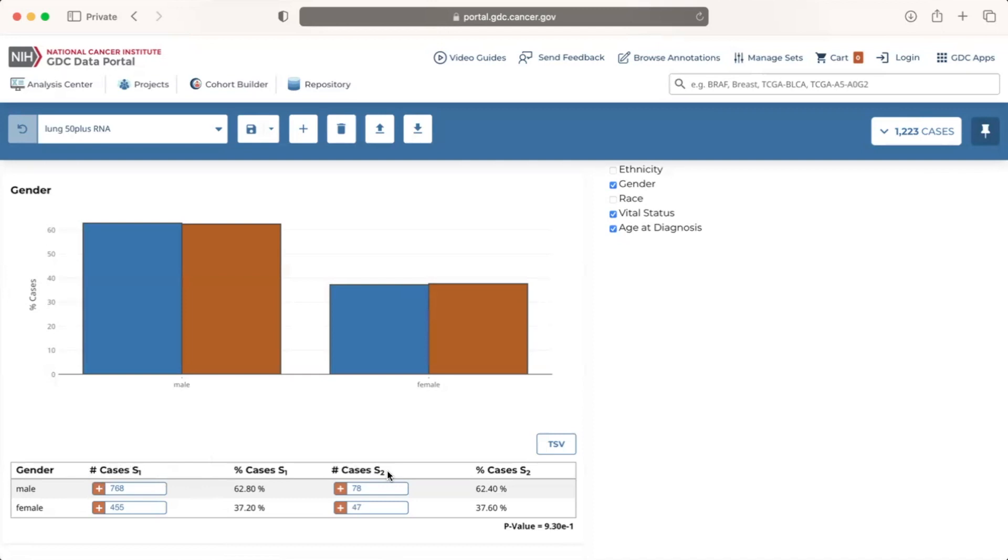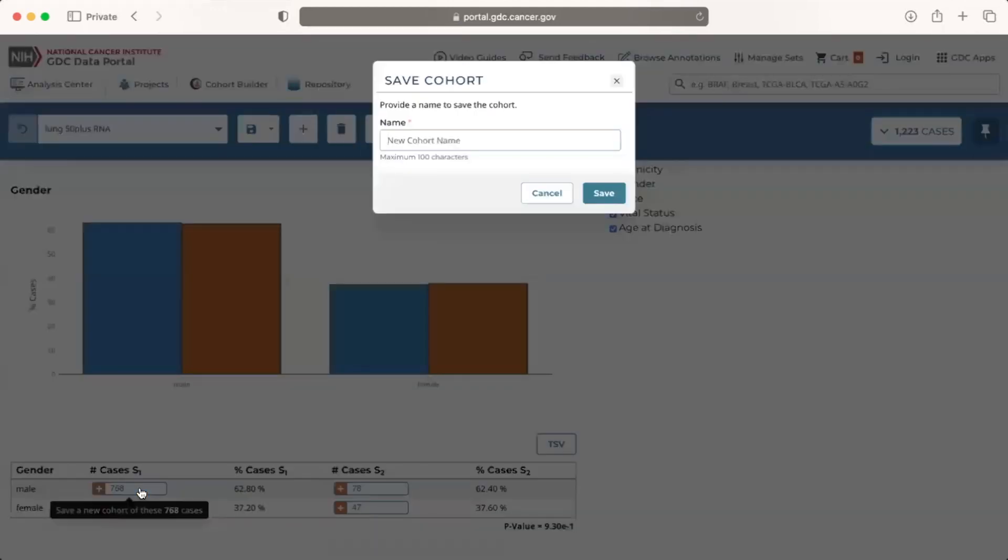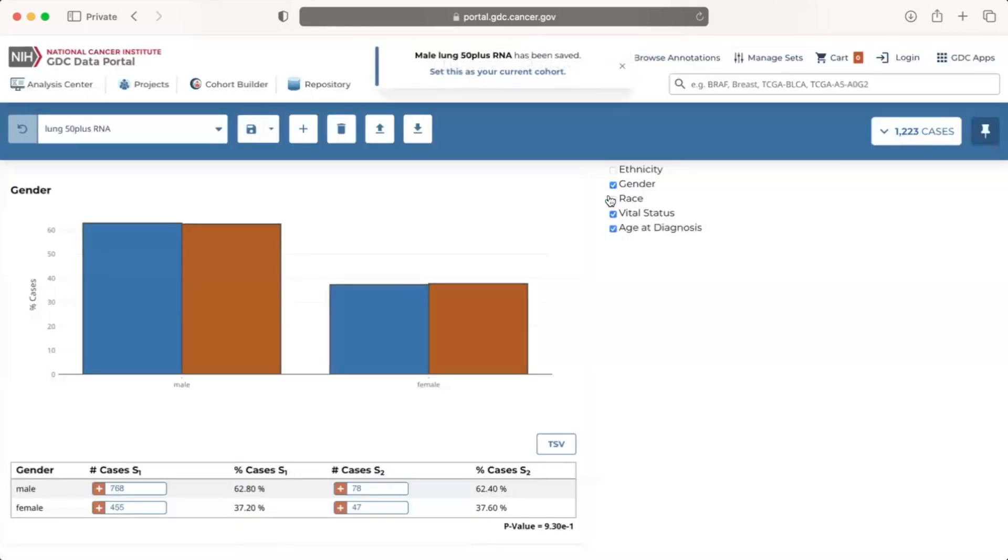To create a new cohort of male lung cancer cases aged 50 plus with RNA-seq data, we will click on the button corresponding to the column number cases S1 and the row male. Clicking on one of the buttons in the number cases columns labeled plus 768 in this example opens a pop-up window where we can save and name the new cohort male lung 50 plus RNA. Once we click the teal save button in the bottom right corner, the cohort will save as indicated by a message at the top of the screen and the cohort comparison tool page will return.